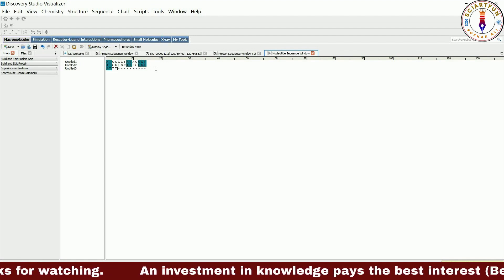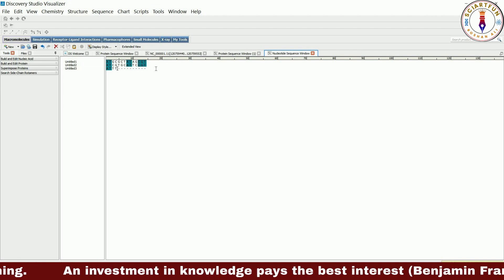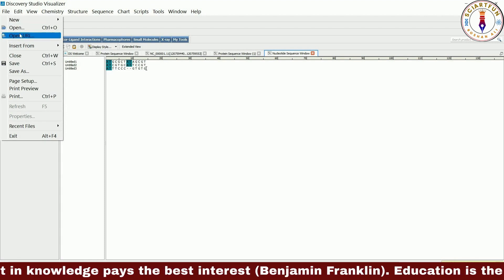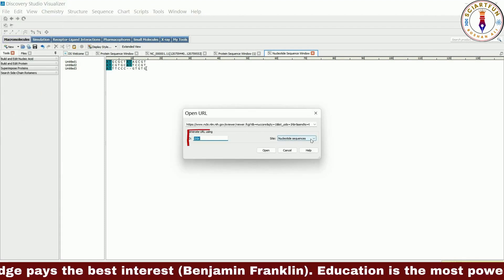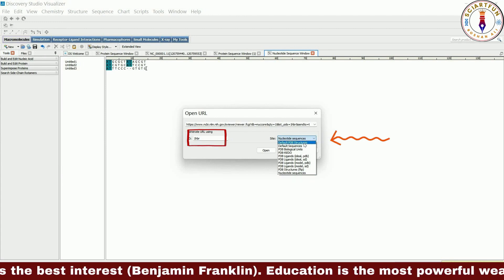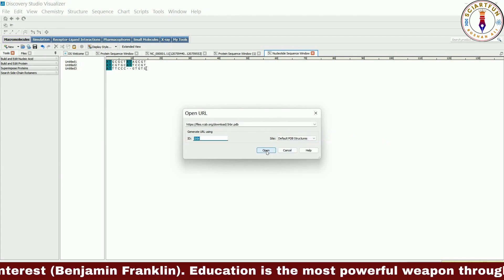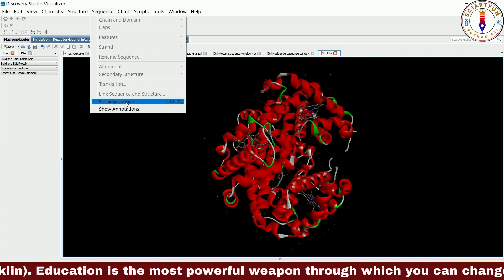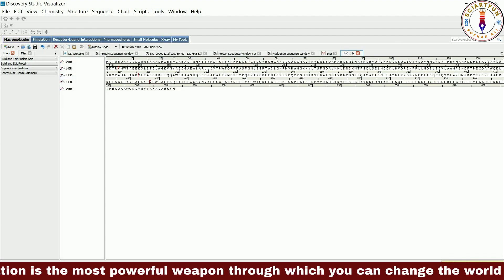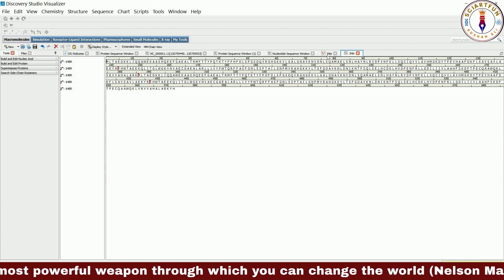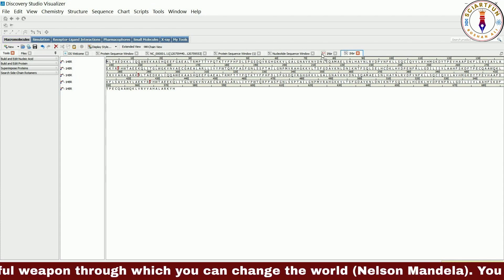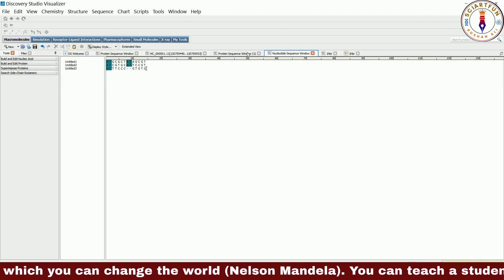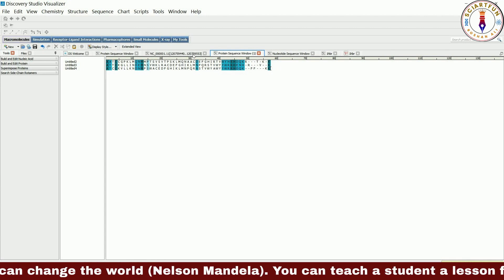In our fourth method we can extract the sequence from an already opened molecule structure. To do so let's first open a protein structure. Here you type the PDB ID, select PDB and go. Now go to the sequence menu and click on show sequence. Here is our expected sequence. As this was a multi-chain protein, you are seeing four chains of sequences. So these were some of the methods which we can use to open a sequence window.